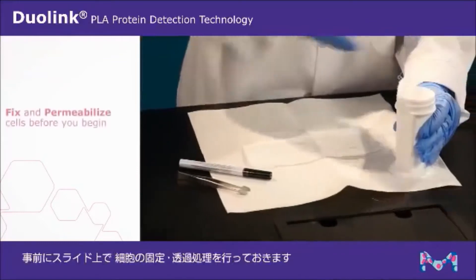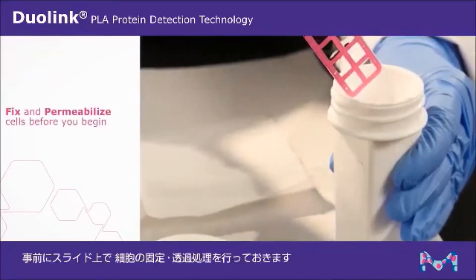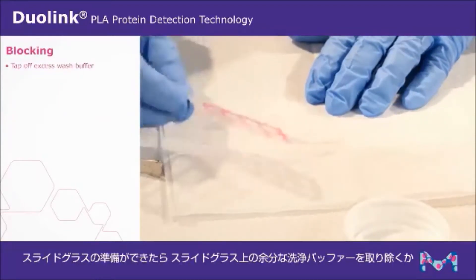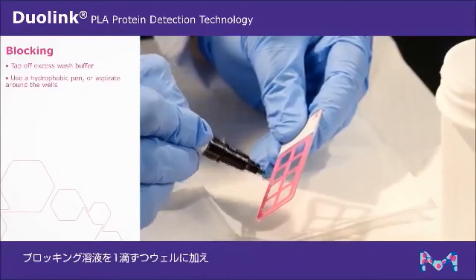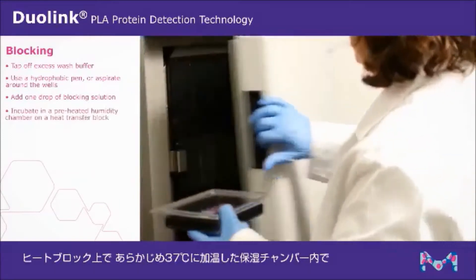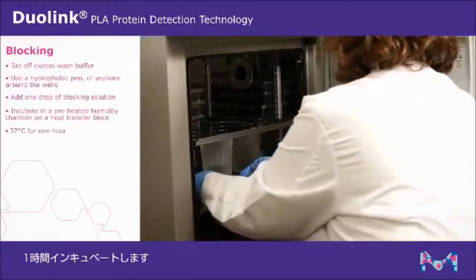Your sample must first be fixed and permeabilized on the slide before you can begin. When you are ready, tap off excess wash buffer and use a hydrophobic pen or aspirate around the wells. Add one drop of blocking solution per well and incubate in a preheated humidity chamber on a heat transfer block at 37 degrees Celsius for one hour.